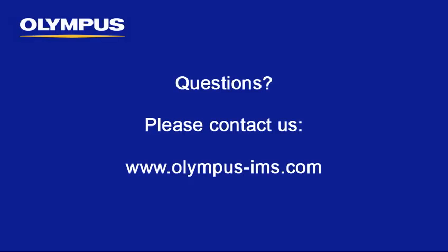In this instructional video, we have covered generating EFI images within the Olympus Stream image analysis software. We hope this video has been beneficial and we invite you to contact us directly with any questions.